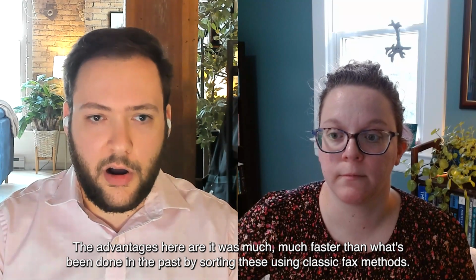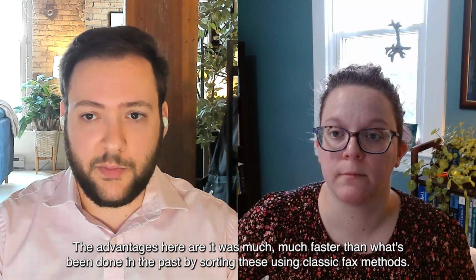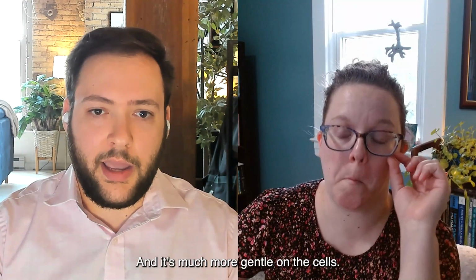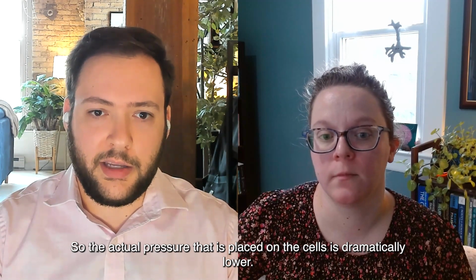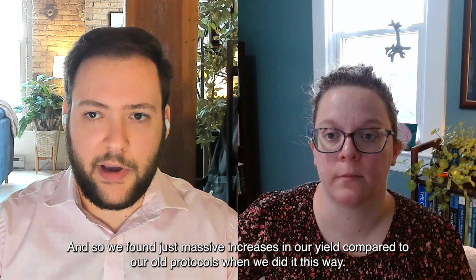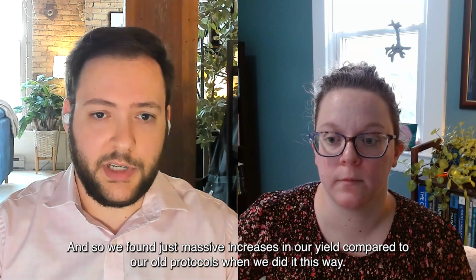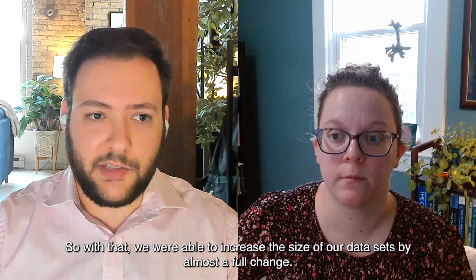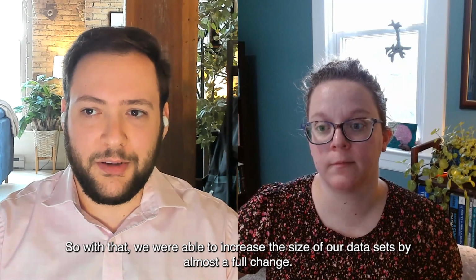The advantages here are it was much, much faster than what's been done in the past by sorting these using classic FACS methods. And it's much more gentle on the cells. So the actual pressure that is placed on the cells is dramatically lower. And so we found just massive increases in our yield compared to our old protocols when we did it this way. So with that, we were able to increase the size of our data sets by almost a full fold change.